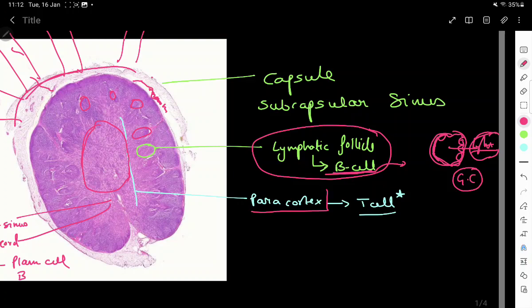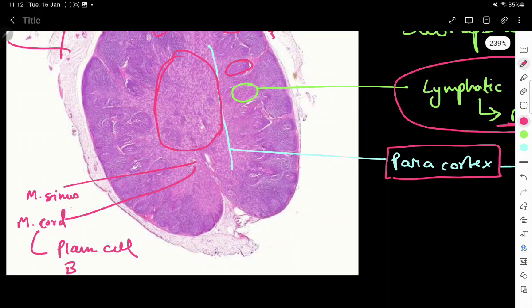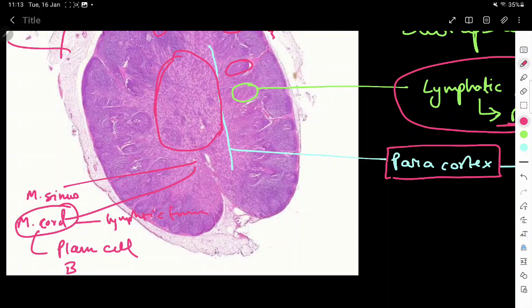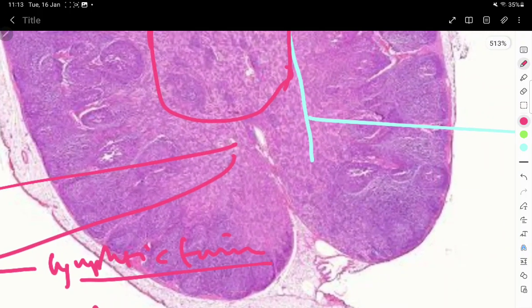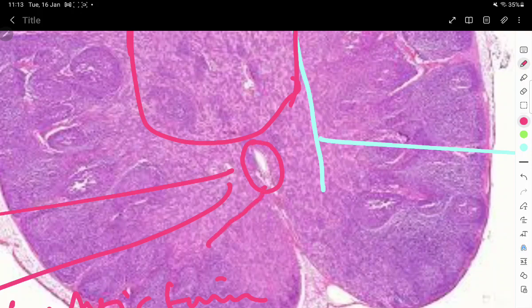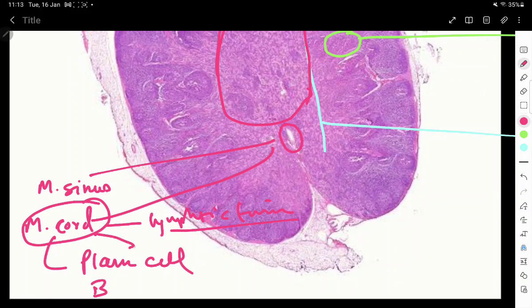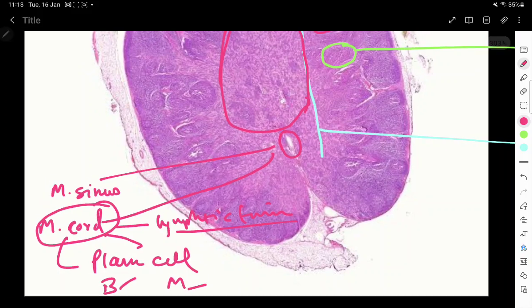The cortex is separated from the medulla via the paracortex, which is rich in T cells — that is the key point to remember. The medulla consists of two things: medullary cords and medullary sinuses. The medullary sinus is a space that can be filled with fluid or can be empty, seen in the center. Surrounding it like a sheet is the medullary cord, which is formed by plasma cells, B cells, or macrophages.